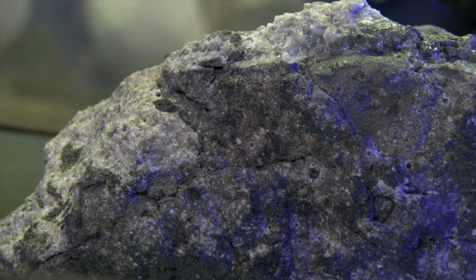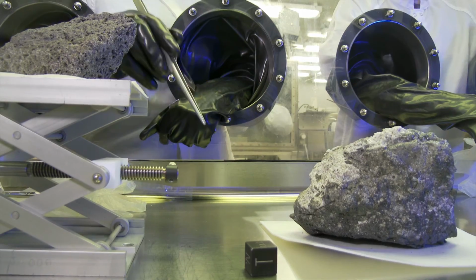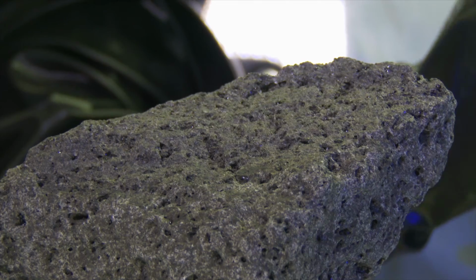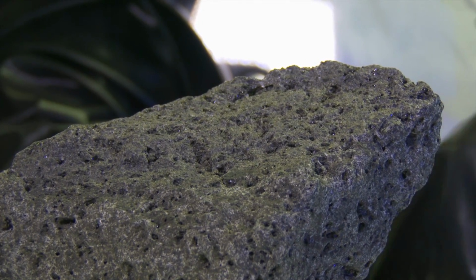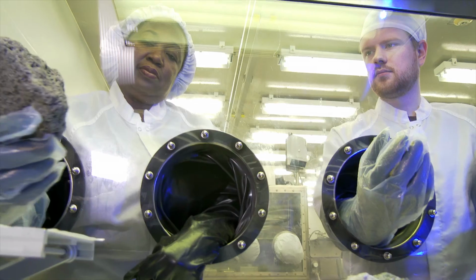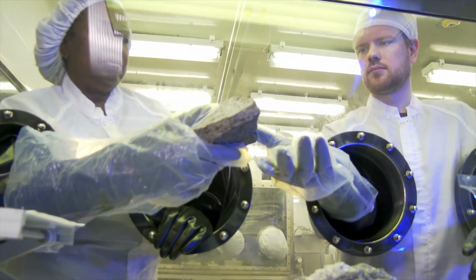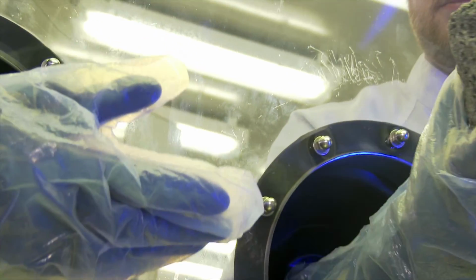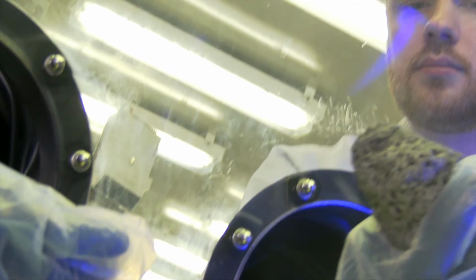We are not just taking care of the samples for what we can do right now, we're also holding on to the samples for the techniques that we're going to have in the future and the types of analyses that are going to be done in the future. And those analyses inevitably are going to require smaller and smaller amounts of sample and lower detection limits. And so we must protect the samples against contamination to the lowest degree possible.